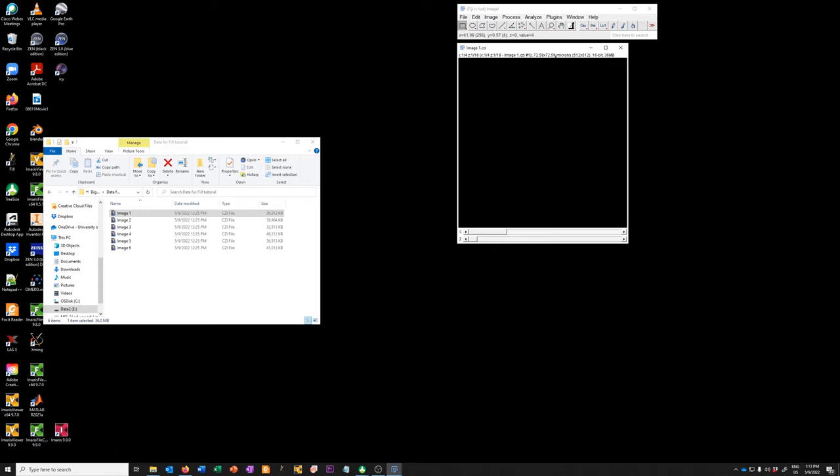Save this as a TIFF — call it 'image1_rgb.' If you now go to that image and double-click it, Windows Explorer shows it exactly how it was displayed in Fiji. Very useful. One other thing that is quite necessary is to add a scale bar to this image, because whenever you're showing a microscopy image people need to know the scale. There has to be at least one scale bar in a set of related images so people can figure out how big things are.